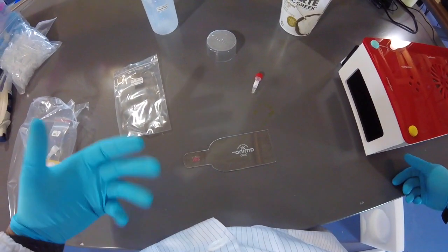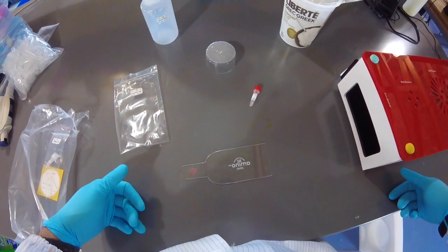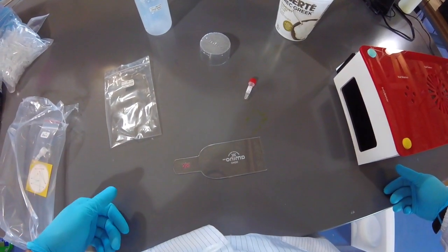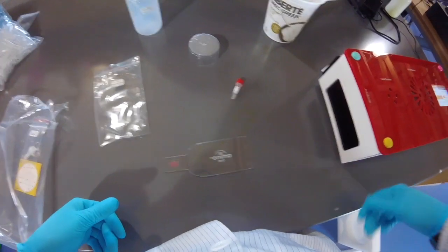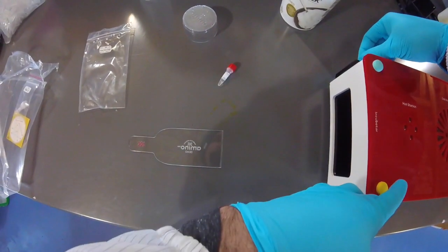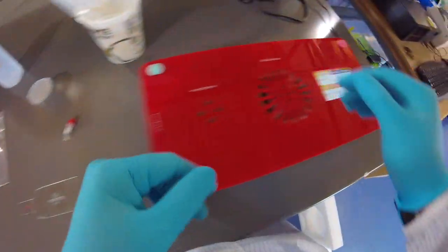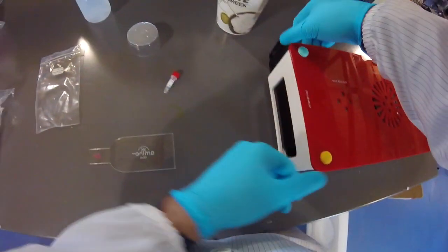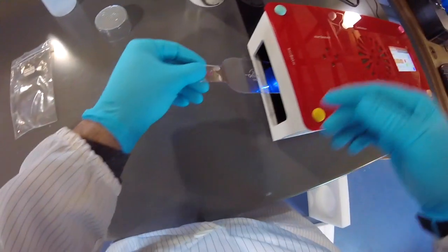And then yesterday we also did a positive control where we put some pre-engineered cells, meaning cells that already have a DNA plasmid with a selection marker in it, and we spread those out on a plate, and we're going to see what those look like today as well. So I'm just going to open here, and again we're at about 20 hours and 29 minutes here. All right, so let's open that. Let's grab our plates here.